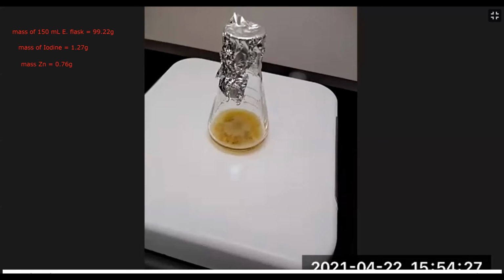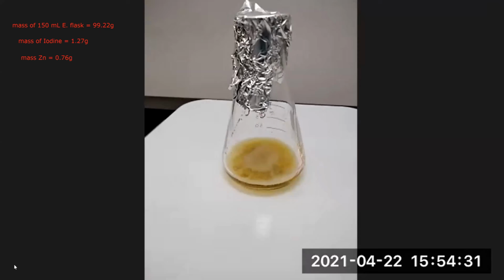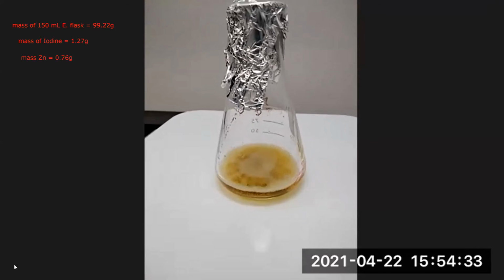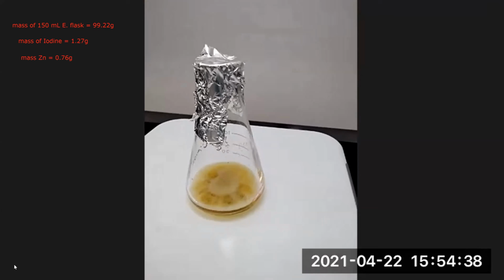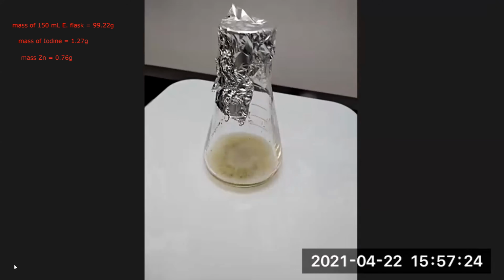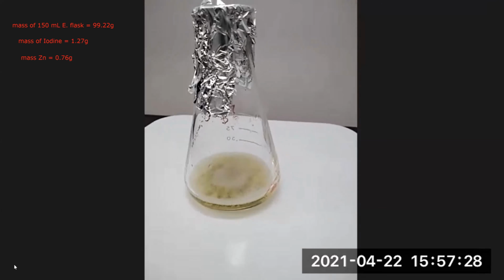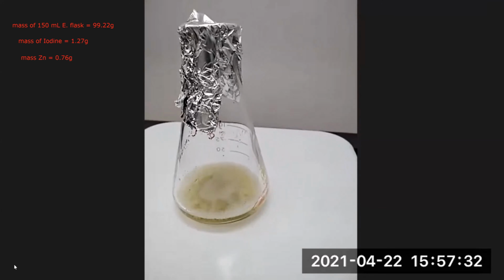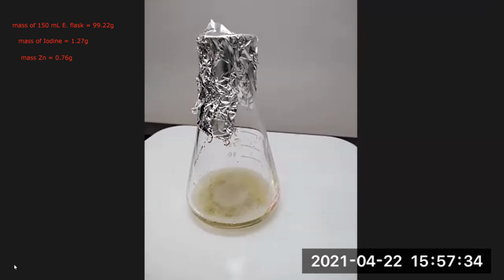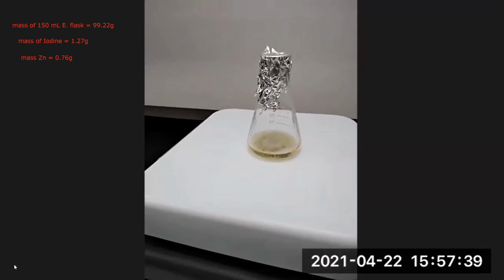After some more time, it starts to get to a lighter, golden yellow. Again, this is over the span of 20, 30, 40 minutes, an hour. So now it's starting to get almost done. It's still a little pale yellow. Again, we want it colorless, so that we know that all the iodine has reacted. And this takes a long time to do.